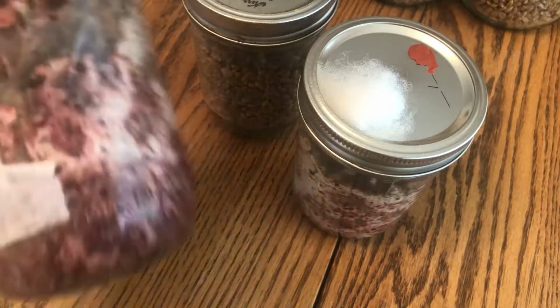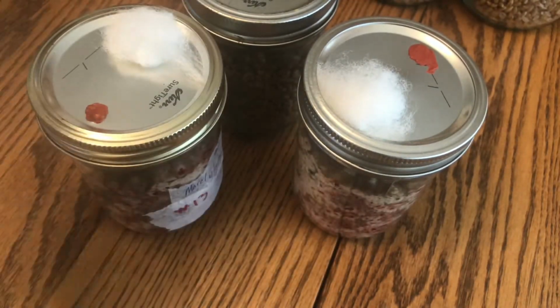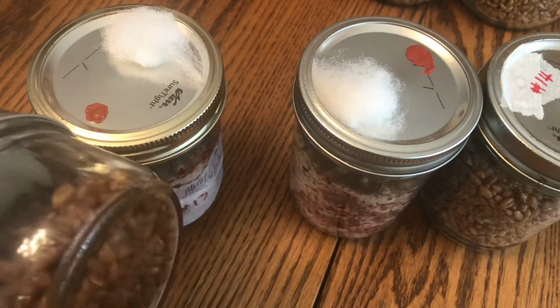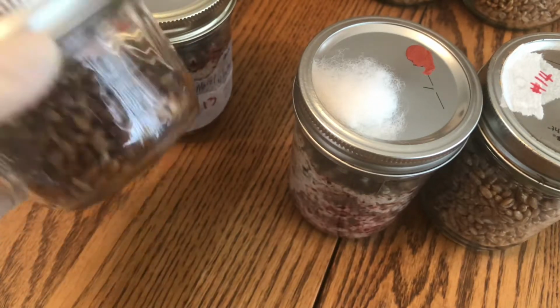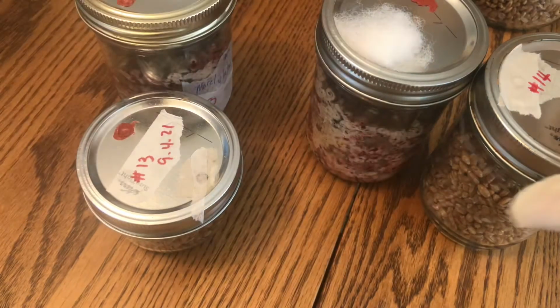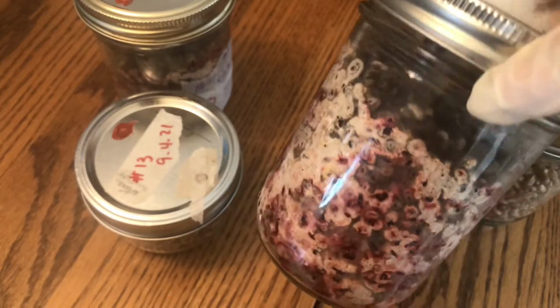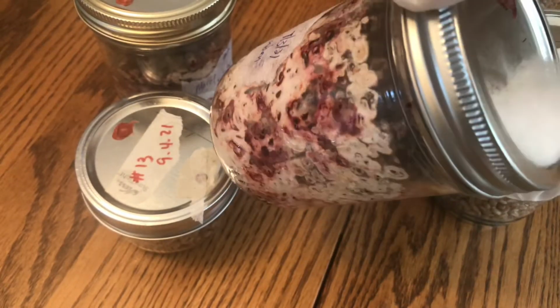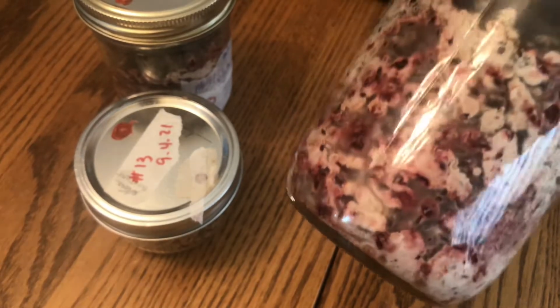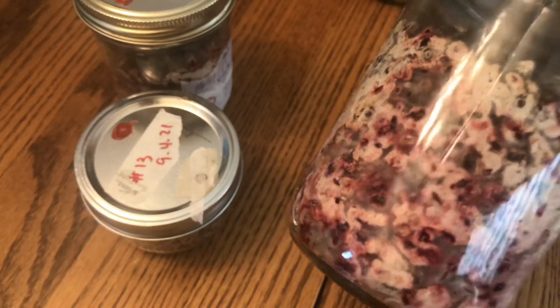There's two of them. So what I'm gonna do today is I'm gonna take a sample from each container, from each jar, put it into this green spawn to see if it's still viable. Maybe it's just the color of the brown paper, that's why it turned black like this. It is different than the one that was contaminated that I throw away. So we'll see.